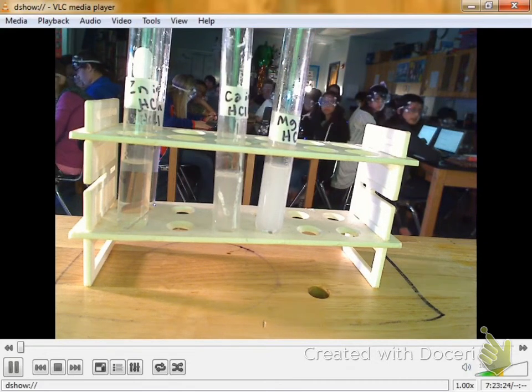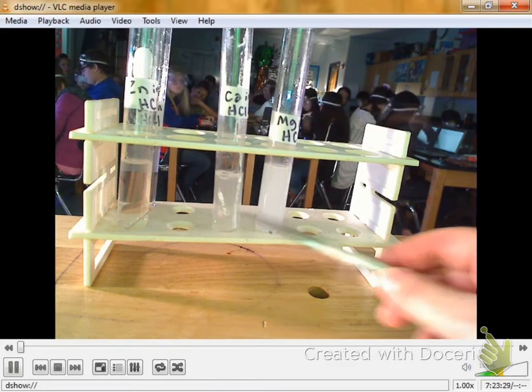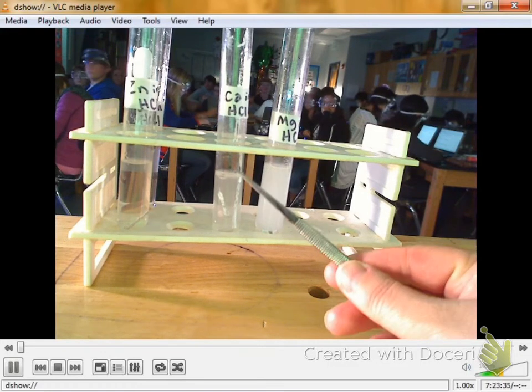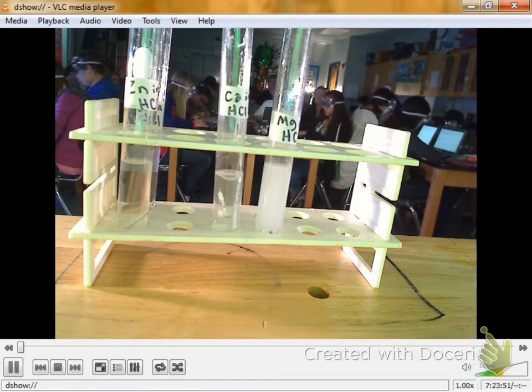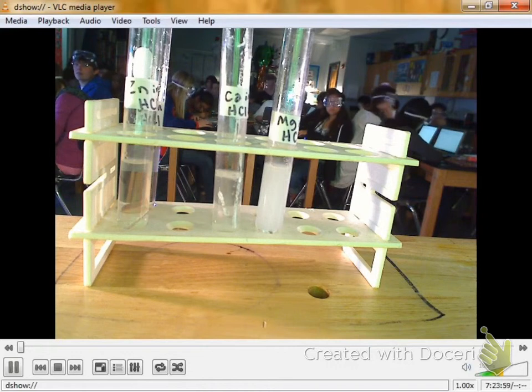But notice what's happening to the water, the color of the water. It was really, really clear, and we're starting to look a lot like our magnesium water over here, aren't we? And you can see the bubbles escaping at the top. So even though it was hard to see the piece of calcium down there on the bottom, it was reacting with the hydrochloric acid. As it's reacting, it's breaking the HCl into 2. The calcium is reacting with the chlorine, making calcium chloride, and the hydrogen gas that used to be part of the hydrogen chloride is escaping out of the top of the test tube.